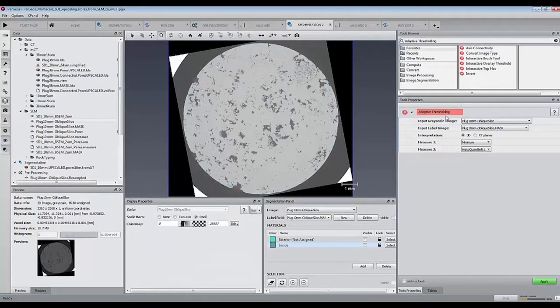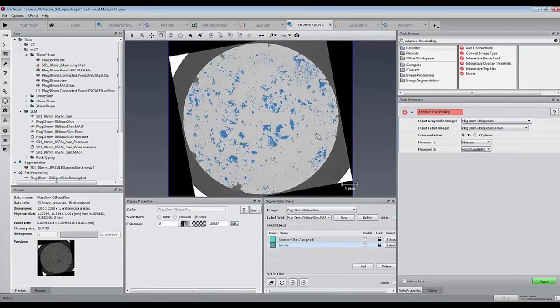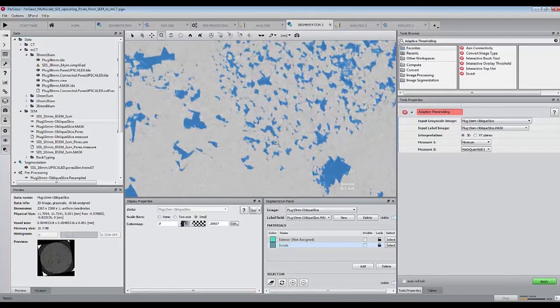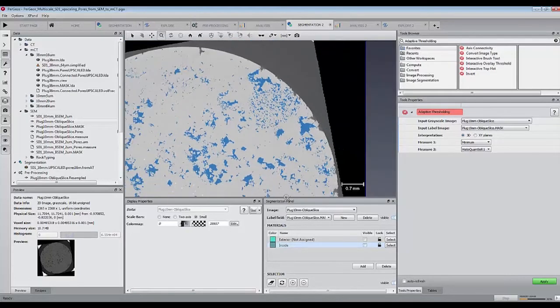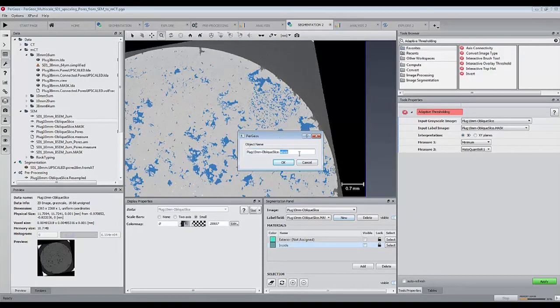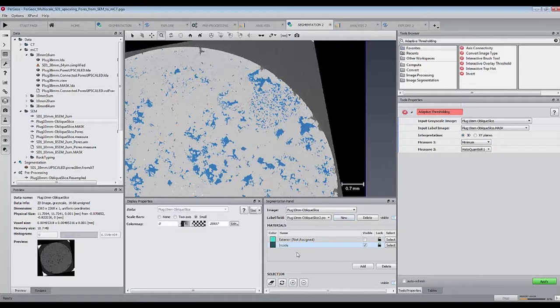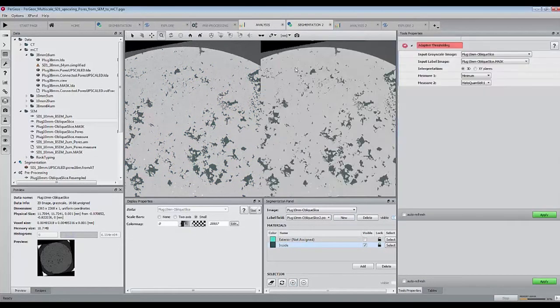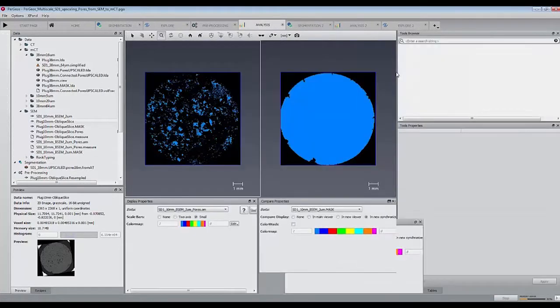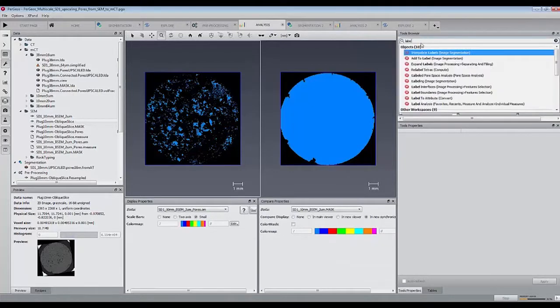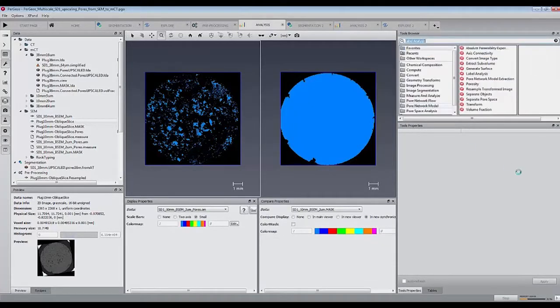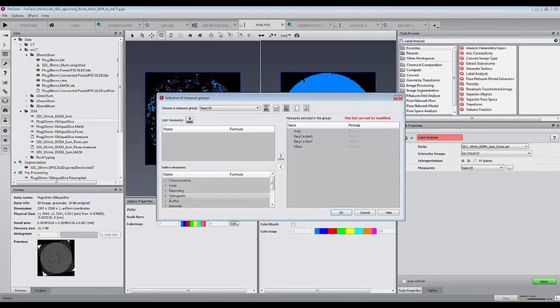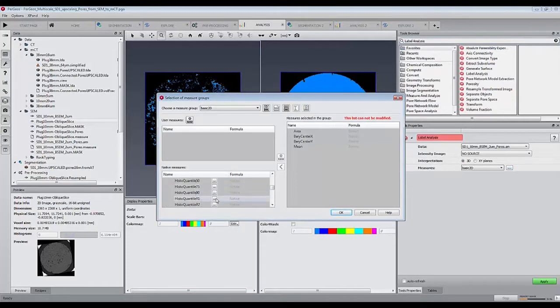Assuming that the pore space is defined in the lowest intensity values, we will then use adaptive thresholding to apply the exact same value of 10.36% and look at the threshold values. The histoquantile R1 value can be set via the label analysis module.